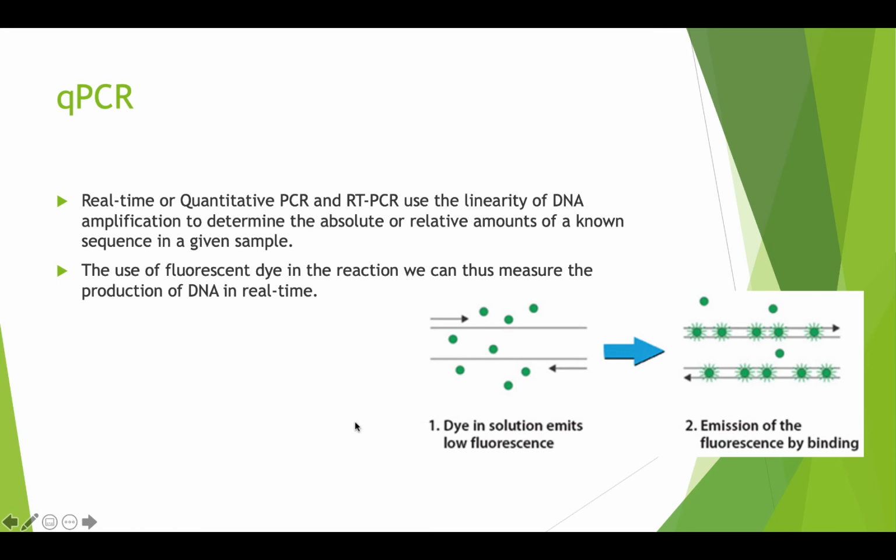It is a fluorescent dye that is present in the mix. This fluorescent dye binds to the DNA when it is being built. So the more DNA you build, the more dye gets incorporated into the DNA, and when it is incorporated in the DNA, it emits fluorescence.